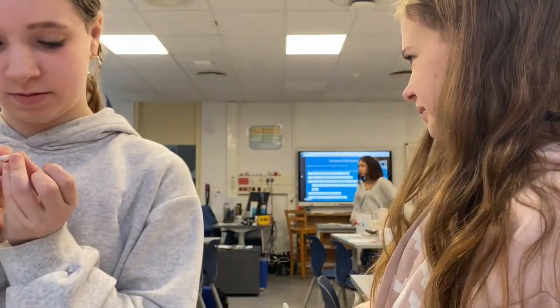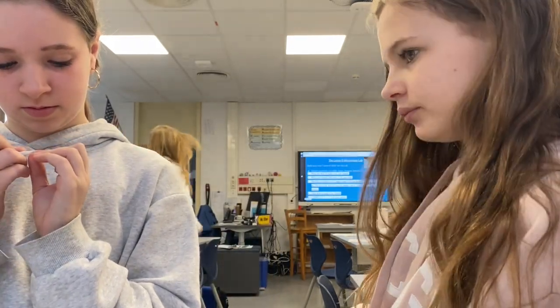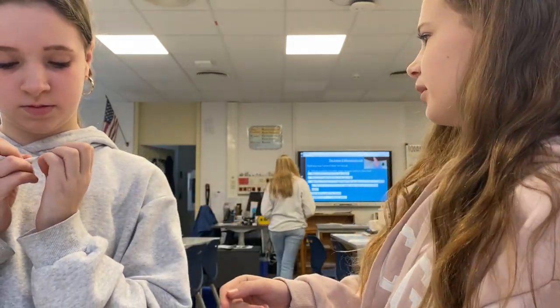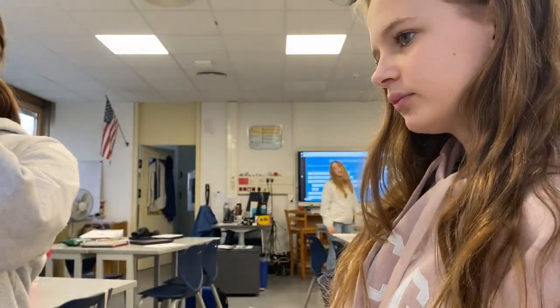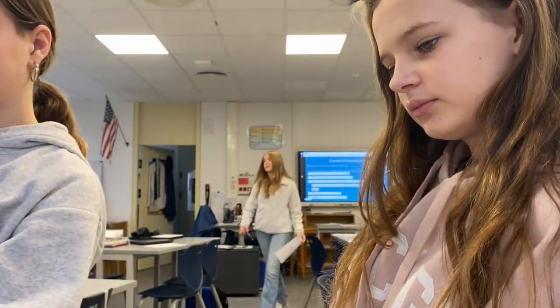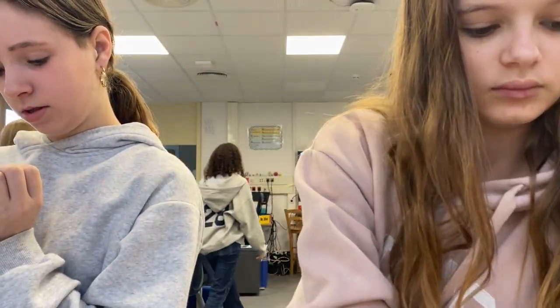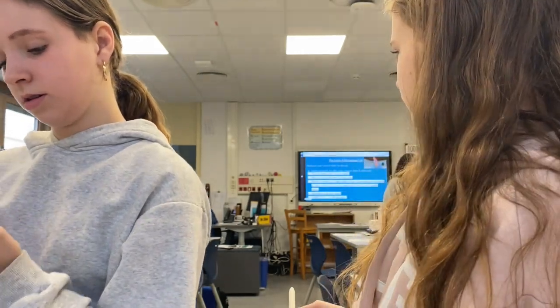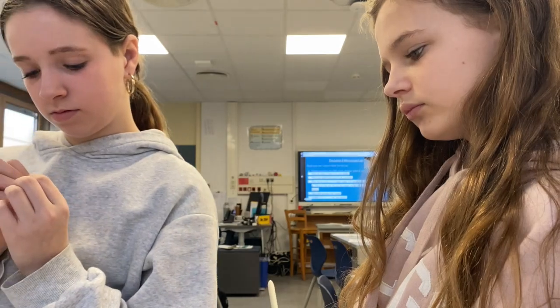Okay, make sure you have your slide ready. Take the slide cover off until we put the water on. Once I put the water on, you're going to put your E on top and then the cover slip. Don't worry too much about air bubbles for this one.